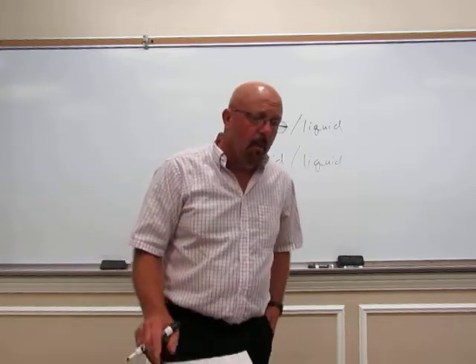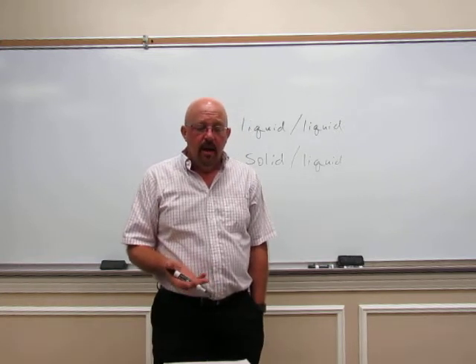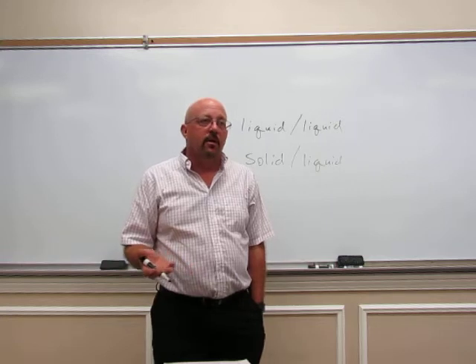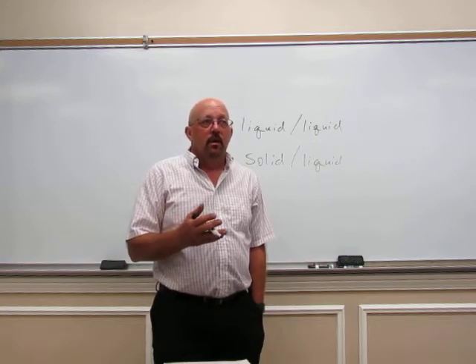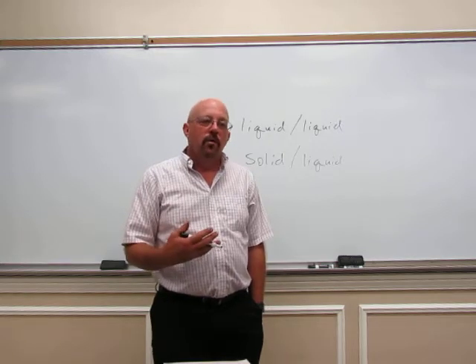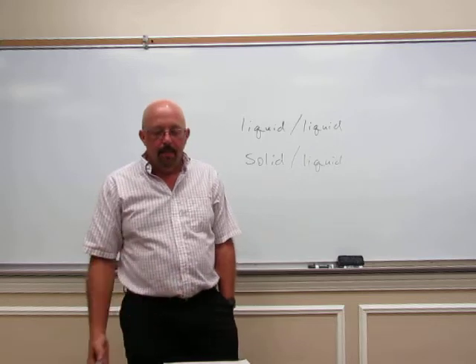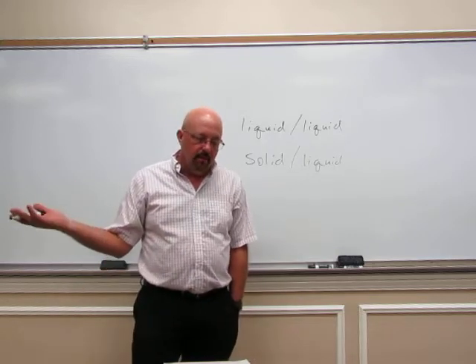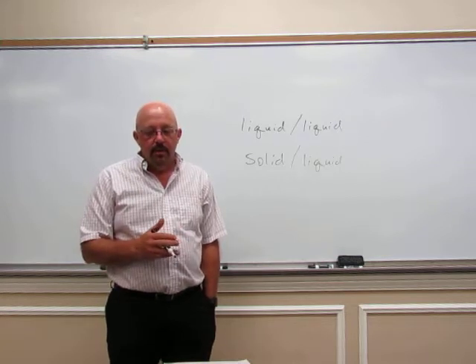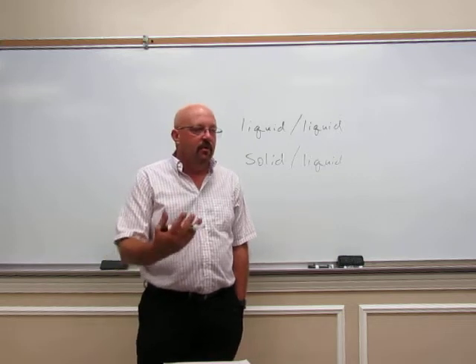Now, extraction is an important step for most organic reactions. Also in the isolation of natural products. You're trying to isolate some compound from some plant. We will use a solvent to extract our desired compound from the plant. We also use it in the lab when we do an organic reaction. So it's one of the ways to purify compounds, to isolate those and to purify them.